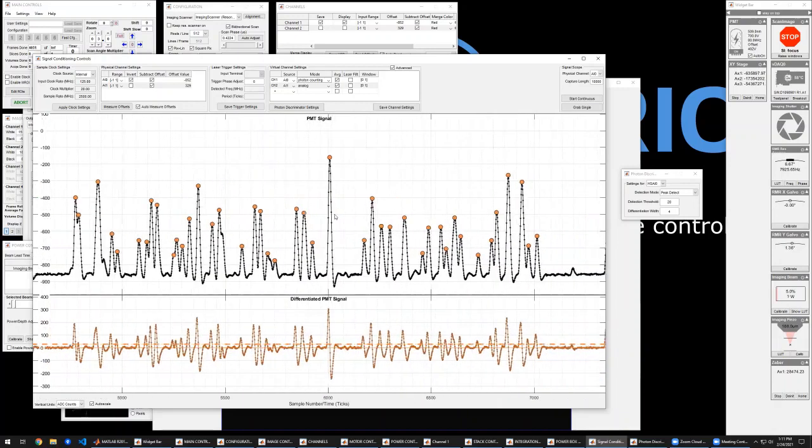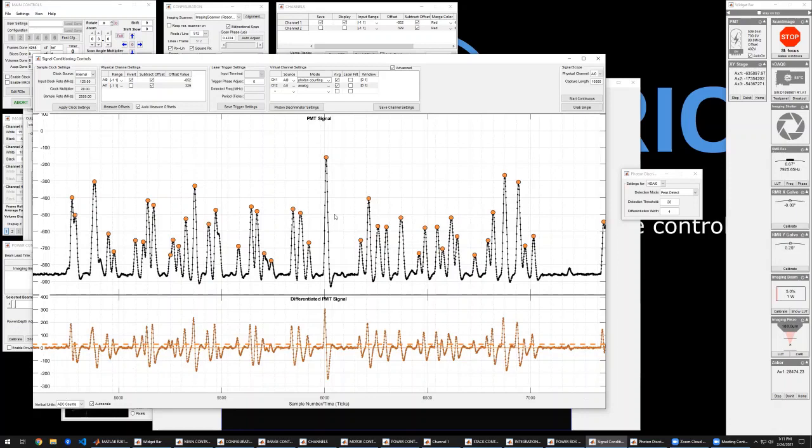If we turn on time correlated mode, which I can't demonstrate here because I don't actually have an 80 megahertz laser, this interface will then allow you to specify if you want to window your acquisition based on the time the photon arrives with respect to the laser pulse. So there's a lot of flexibility that this interface will give you. It'll allow you to add multiple virtual channels here, like Bruce mentioned, up to 64 that you can use to divide your signal based on the temporal information into separate acquisition channels. And that's one of the capabilities that we're working on extending for Dr. Ali Pasha's latest research. So I'll go ahead and turn it back over to Bruce.